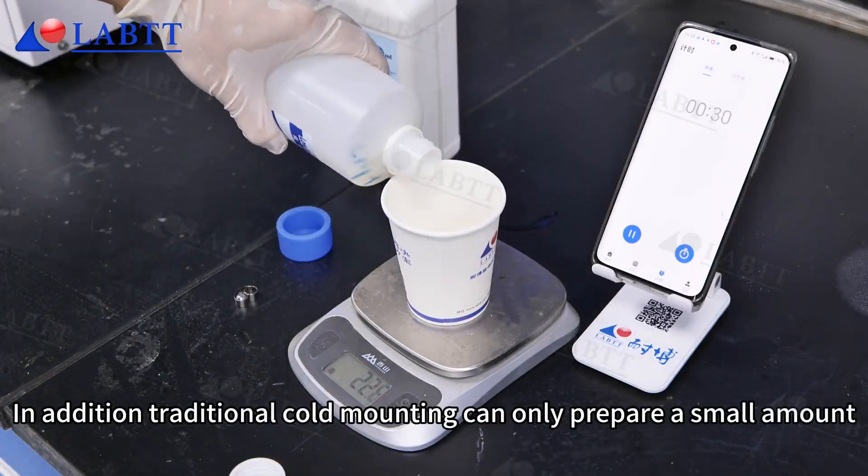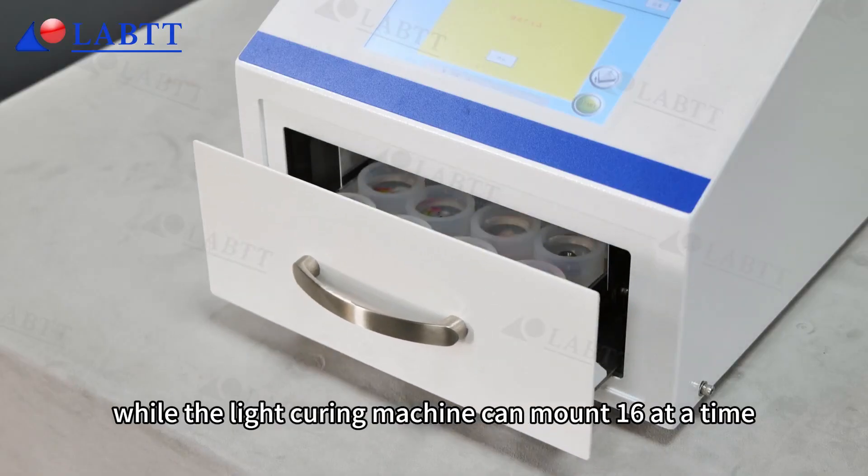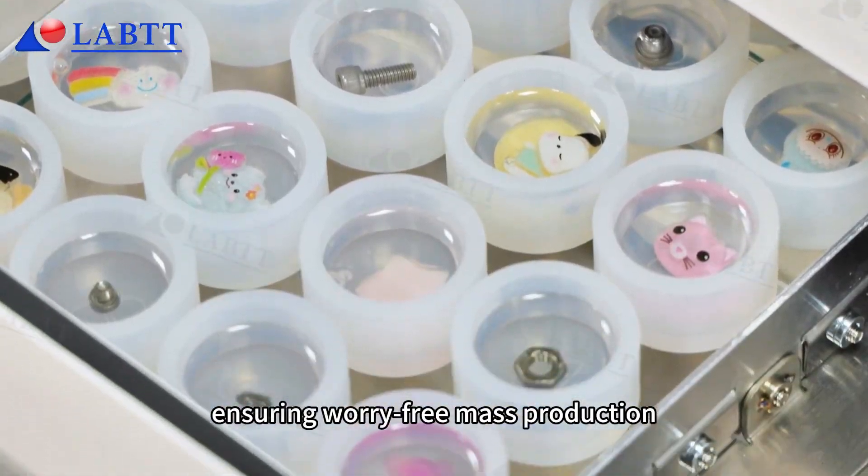In addition, traditional cold mounting can only prepare a small amount at a time, while the light curing machine can mount 16 at a time, ensuring worry-free mass production.